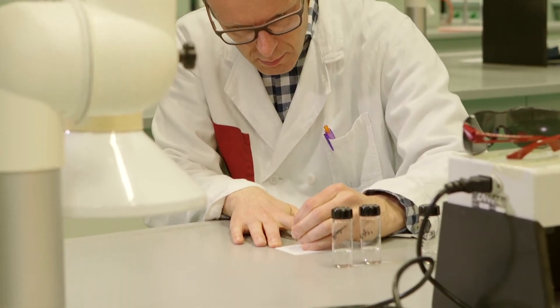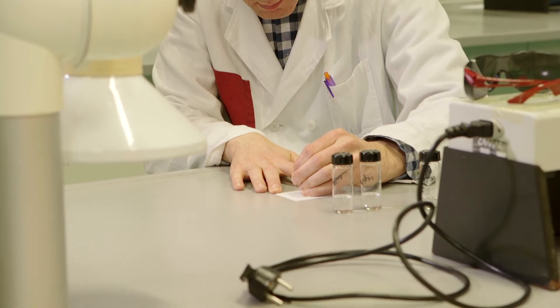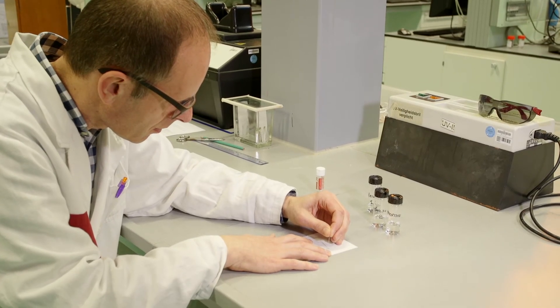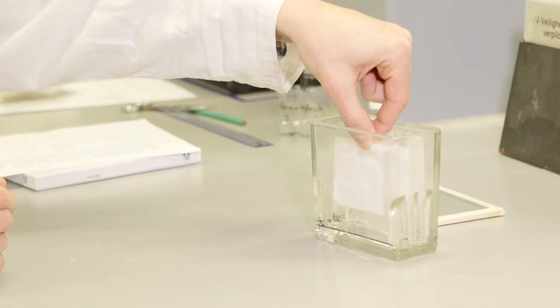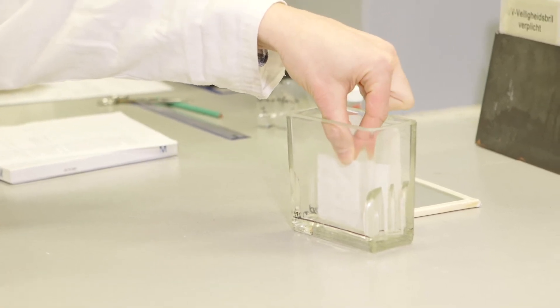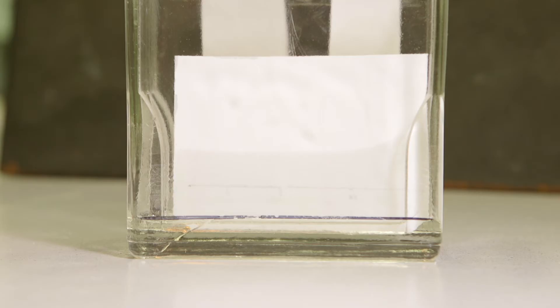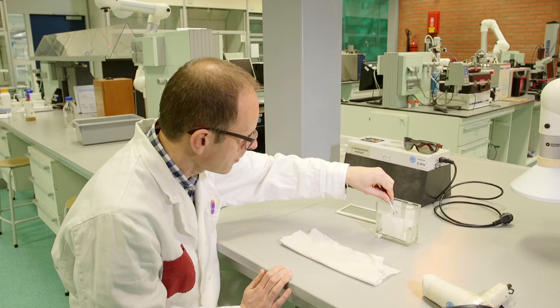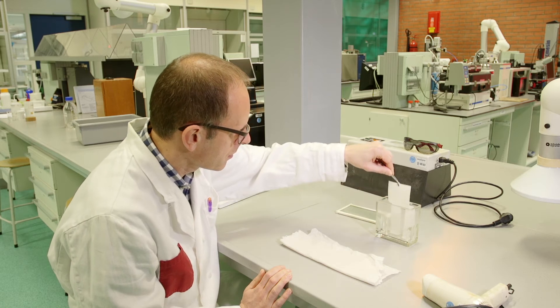The distance between the substances should be about one centimeter. Do not draw the dots too close to the sides. The TLC plate is carefully placed in the tank. When the solvent reaches to one centimeter under the top edge, the plate is removed with a pair of tweezers from the tank.